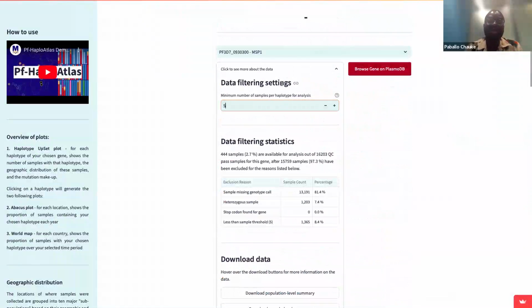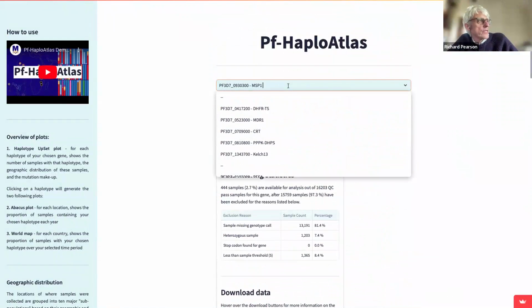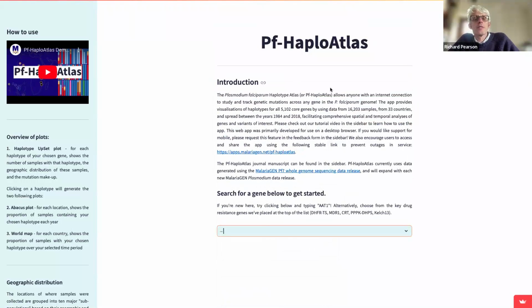Thanks, Helga. I think it's also a gene for which long read sequencing, for example, using Oxford Nanopore or PacBio, is likely to be much better at really understanding the full variation in that gene rather than short reads. This data is largely based on 150 base pair Illumina reads, whereas with the long read you can really get the whole gene within a read. So yeah, thanks for that, Helga.